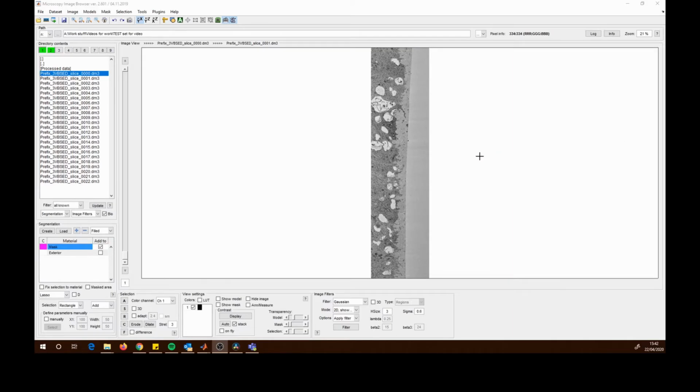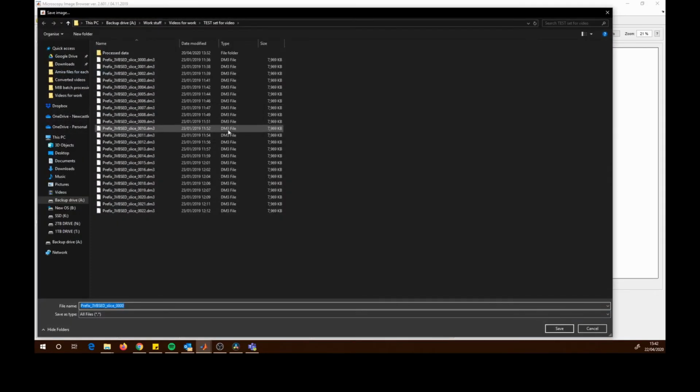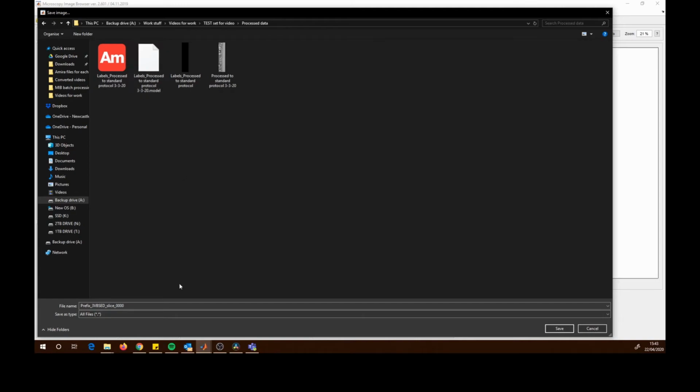Finally, what you want to do is save your dataset after you've post-processed it. You don't want to have to run through the same thing over and over again every time you want to do any analysis or segmentation of this data. So what you can do then is go to File, Save Image As, and then you have a variety of options. I've already saved this, but I can save it again to demonstrate. I'm just going to give it a simple name, 1.